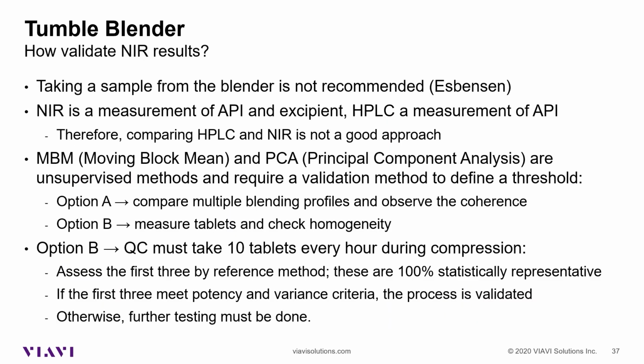How to validate the NIR result? This is a key point. First of all, the first thing that we need to forget is the parallel between NIR and HPLC. On top of that, we saw before starting that taking a sample destroys the blending and is not representative of what you are doing. So this is not a good idea.